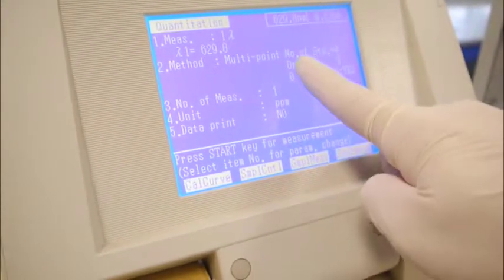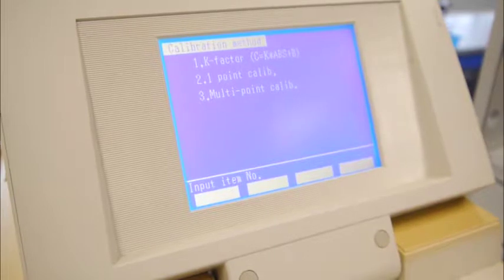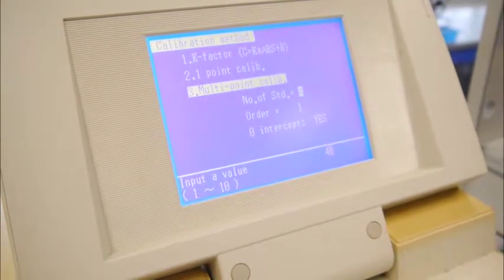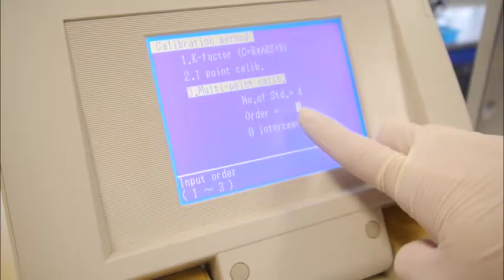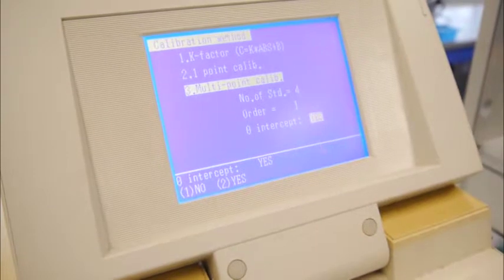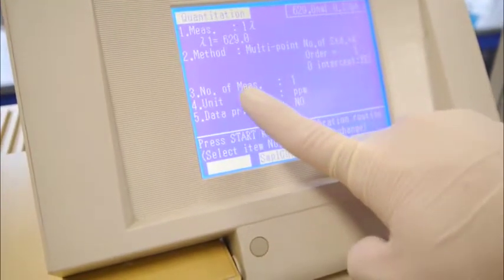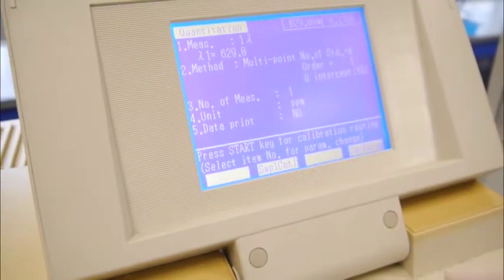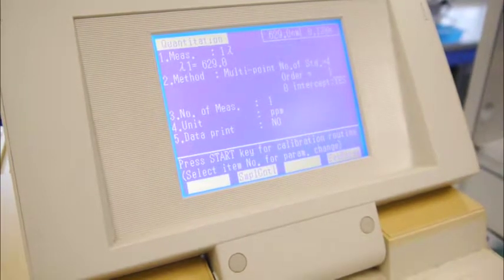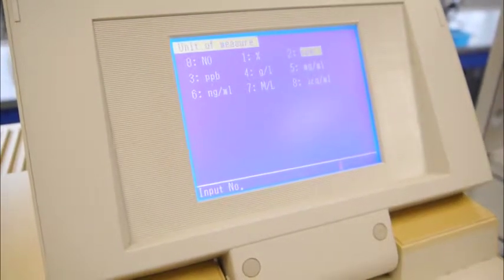We will go to number 2 to do the parameter setting. So we will select multiple point calibration number 3. Because there is a total of 4 standards including the blank, indicate 4 and enter. Then for order, the number of order will be 1. Do we want to intercept the origin? Yes — indicate yes, so number 2 will be yes. For item number 3, number of measurements remains as 1. For the unit, number 4, you have to select the respective units according to your SOP — so just press 2 in this case.